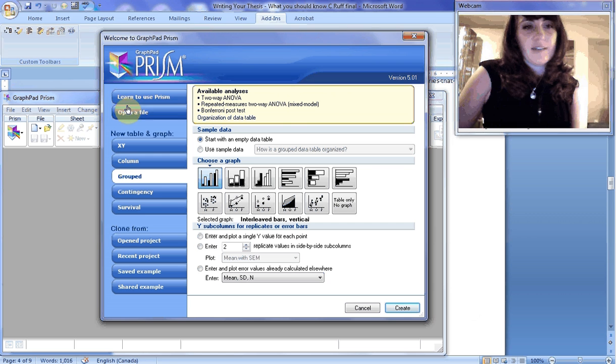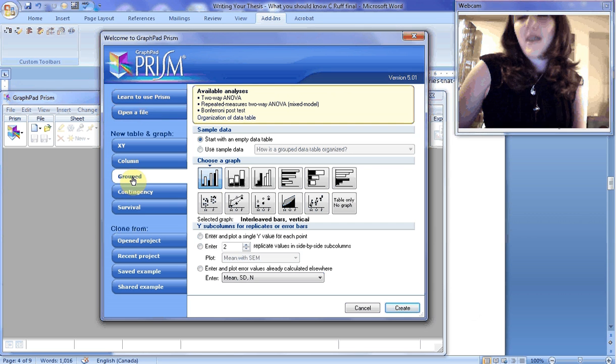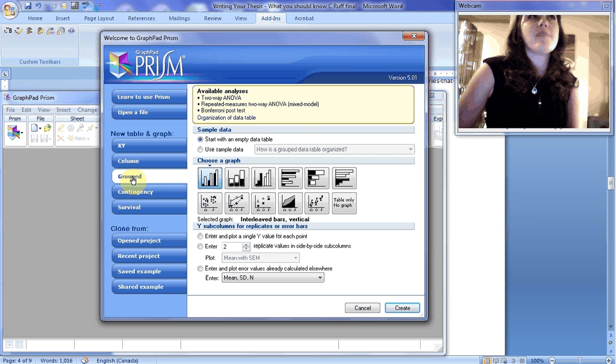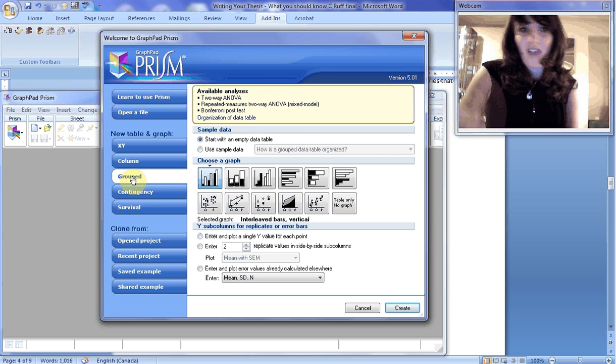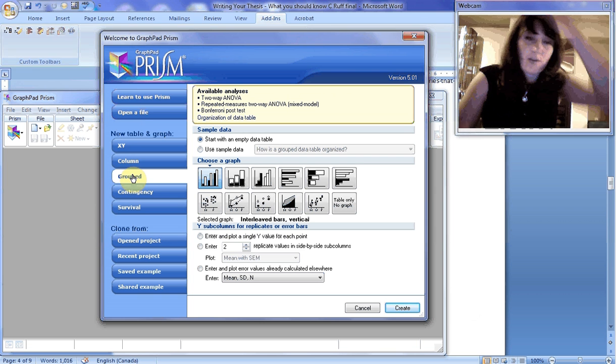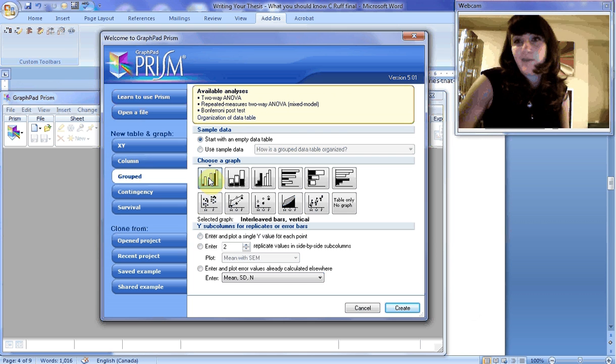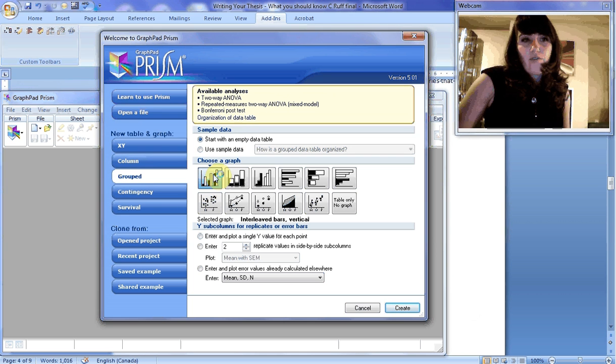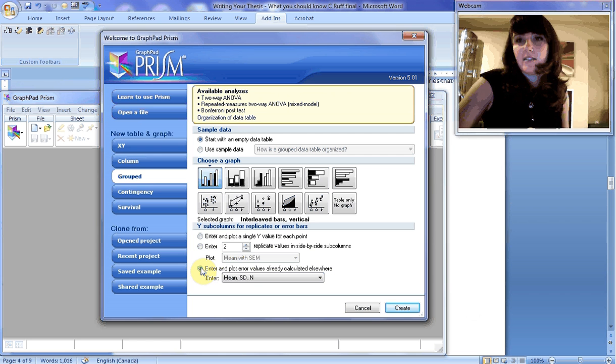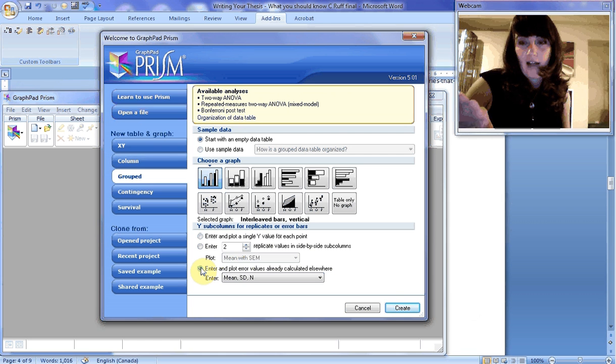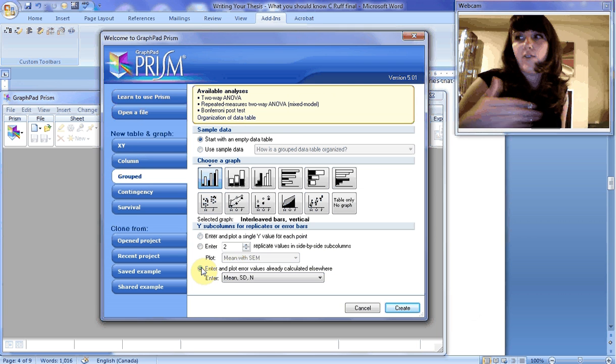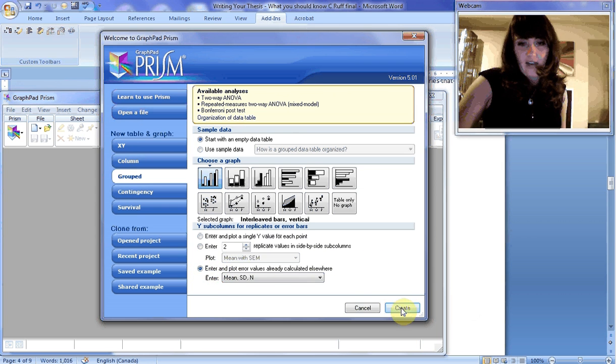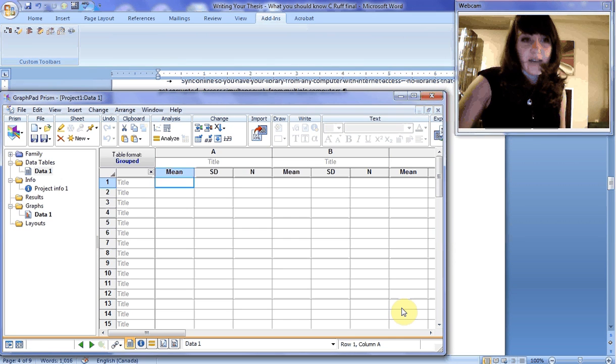GraphPad Prism opens and it's really user-friendly. So you can stick in what you want to use. For example, I always like using a grouped graph. GraphPad is great because they have very extensive online support and video support as well. Today we're going to do a group graph. Start with an empty data table. We're going to enter and plot error values already calculated elsewhere, because it's easier. This is if your data is comparing two things and you can do the t-test in Excel.